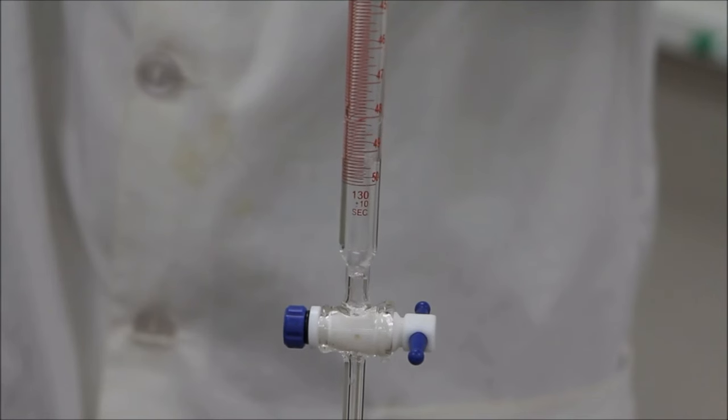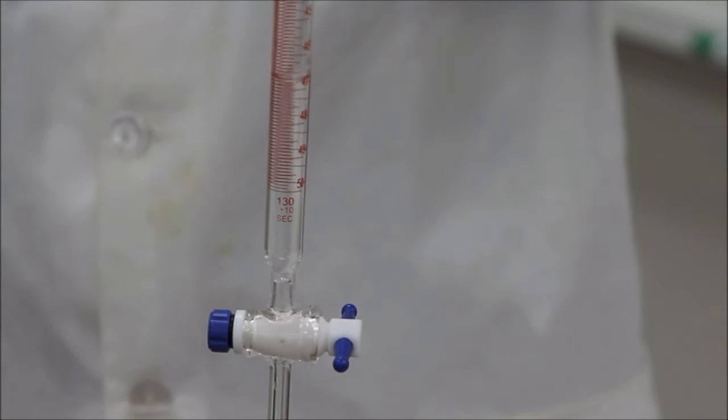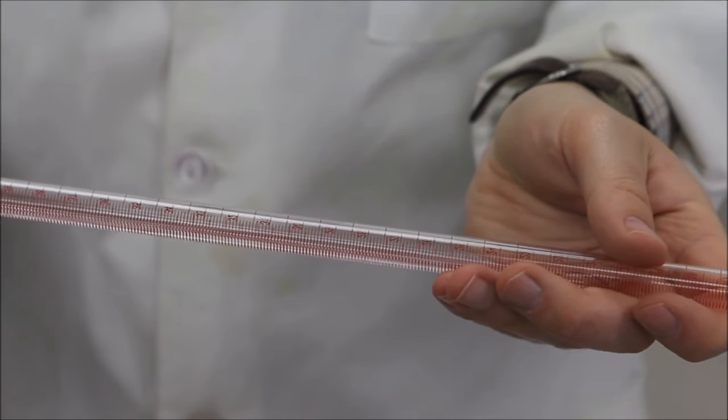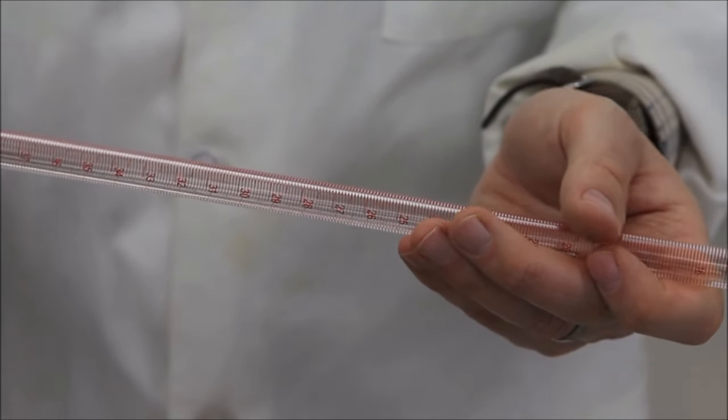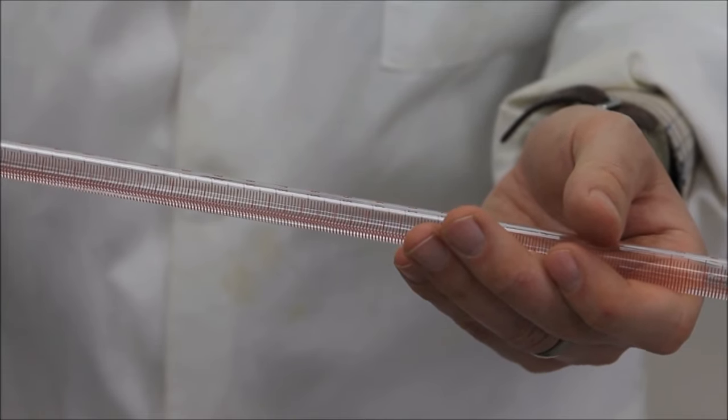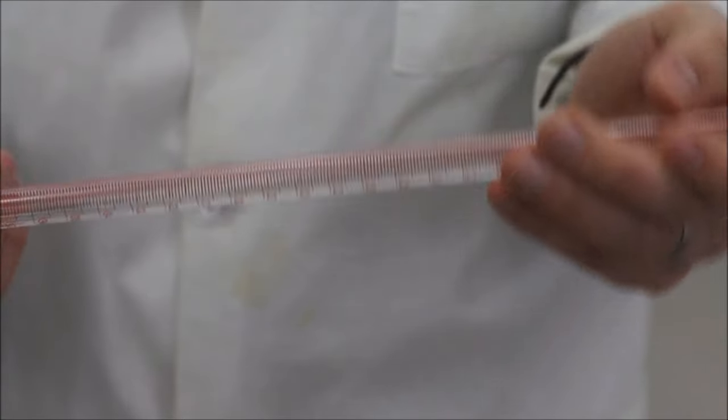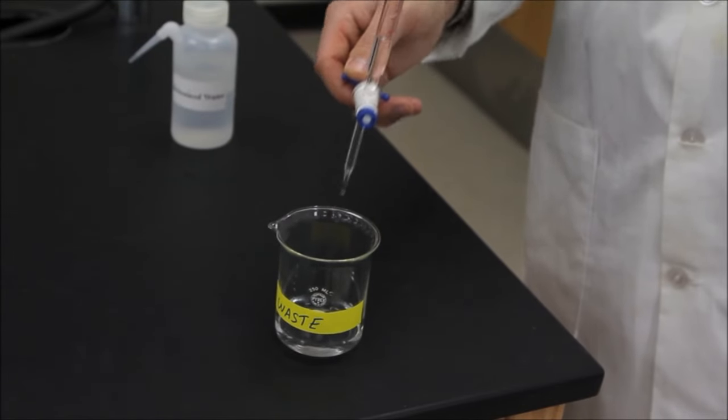Before we begin, it is good practice to first clean and then rinse the burette. To clean, we'll pour a few milliliters of deionized water into the barrel, making sure the stopcock is in the closed position, then turn the burette into an almost horizontal position. The deionized water should then slowly flow towards the top of the barrel. Holding this position, rotate the burette, which will efficiently coat the insides of the barrel with the deionized water. After 5 or 10 seconds of doing this, let the rinsing water drain into our waste container, and then repeat this cleaning step with two additional small volumes of deionized water.